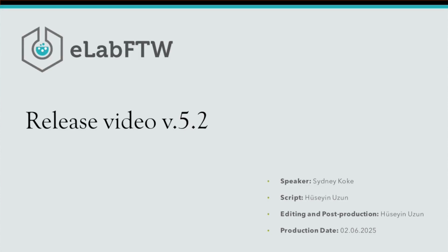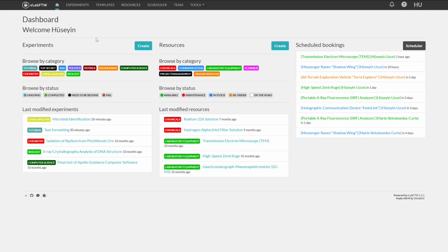Welcome to our eLabFTW release video. In this video, we will show you the newest features introduced in version 5.2. Let's get started. The top navigation bar has been redesigned.